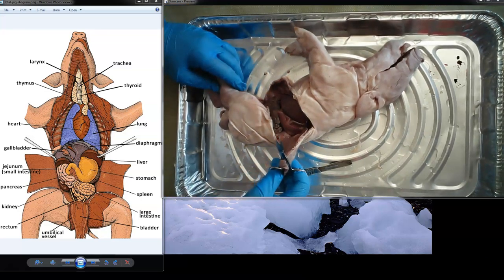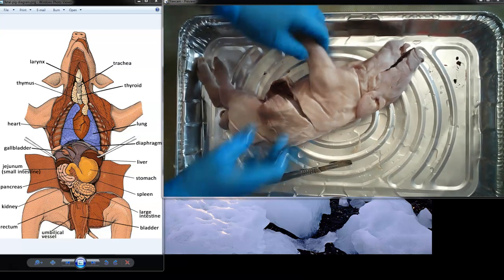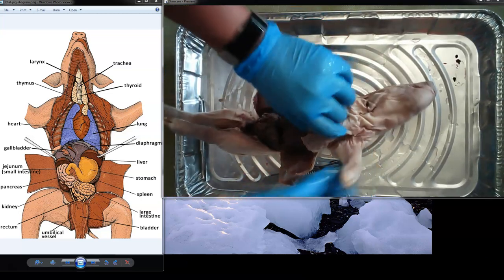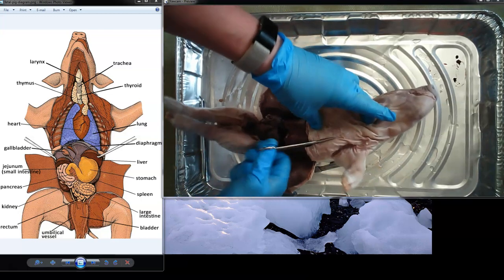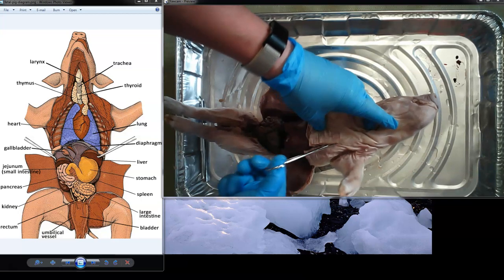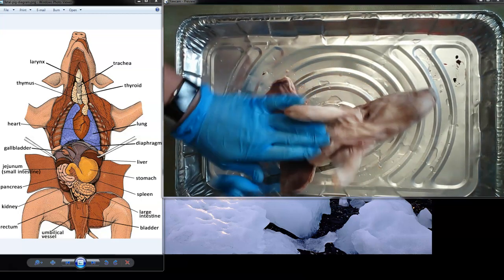Could you touch it? Yes, you can. Let me finish cutting first. Okay. Is that your question, too? Are we going to cut into the eyes? We can cut into the eyes if you want. I don't know if I want to put that on video, but we can. And can we cut the snout? The nose? Remember to raise your hand, right? Yeah, right. Okay.